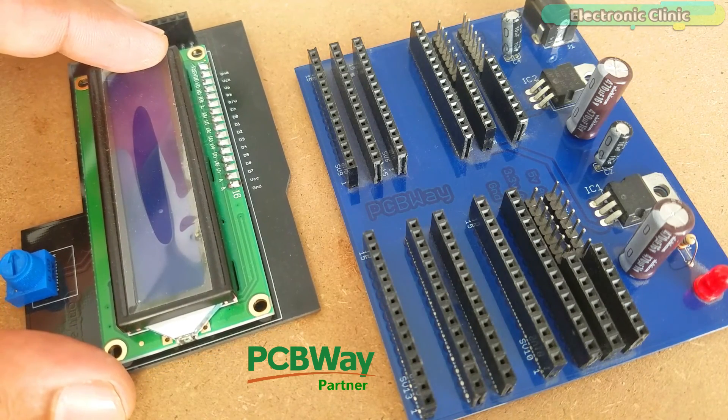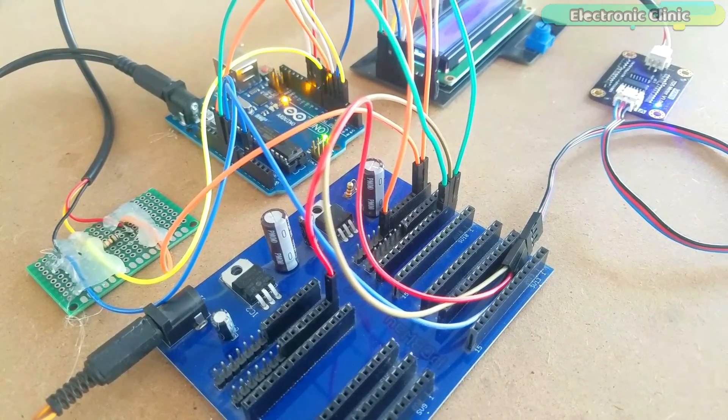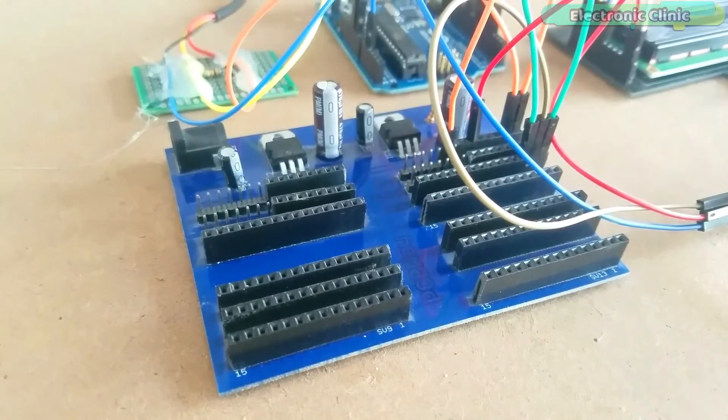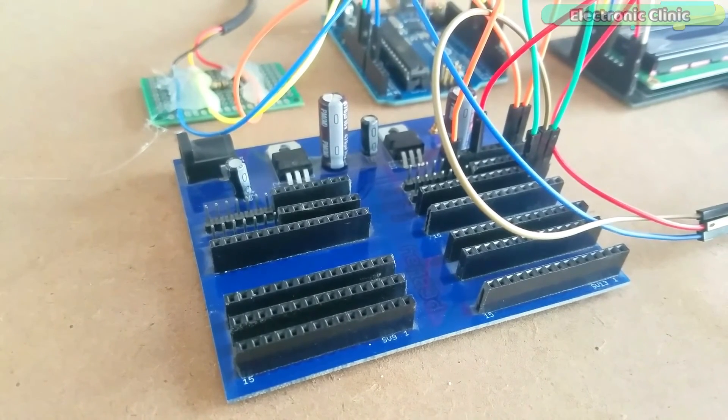For easy interfacing, I designed PCBs for the 16x2 LCD and power supply, manufactured by PCBWay. The quality is really great — the silkscreen is quite clear and the black and blue solder mask looks amazing. I am 100% satisfied with their work. All connections are done as per the circuit diagram. This is the power supply board used to distribute the 5V and ground wires.